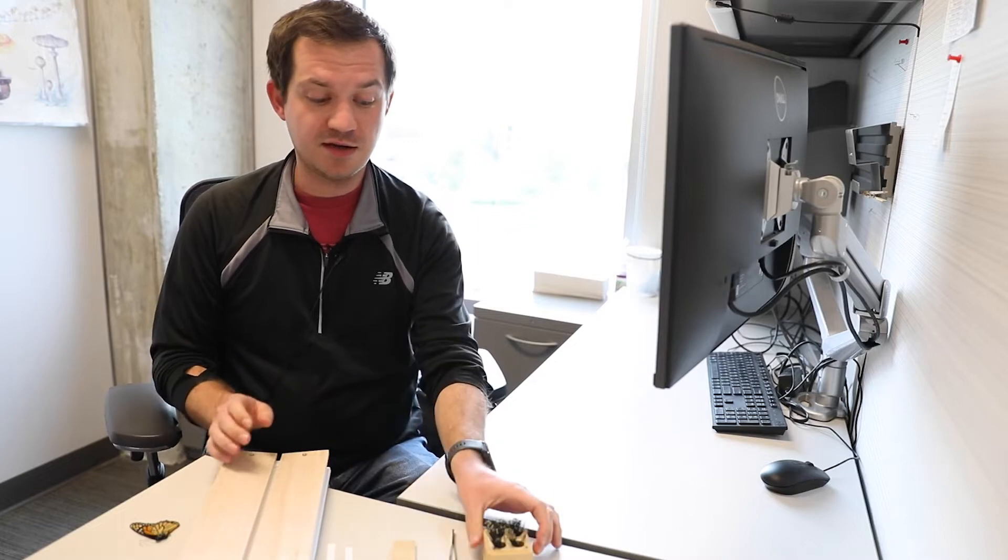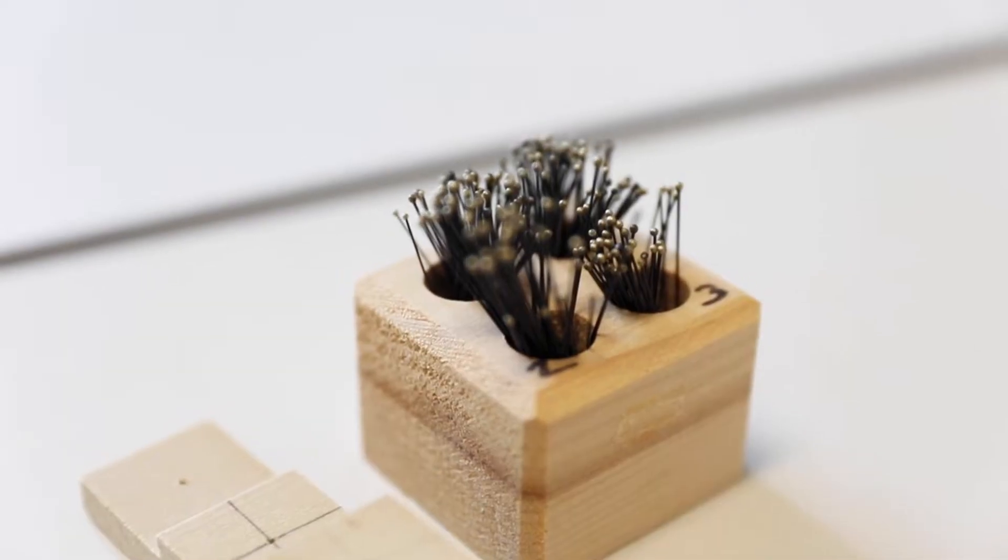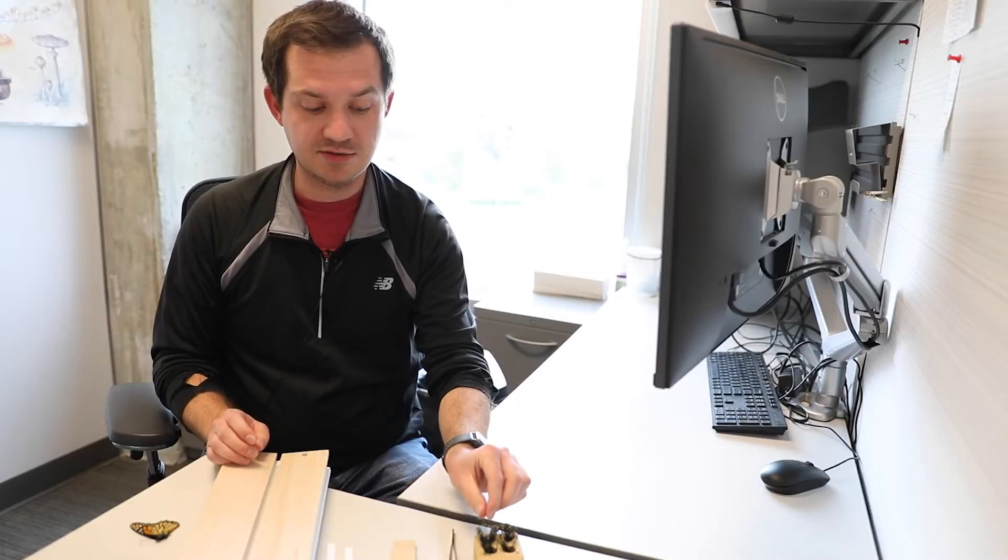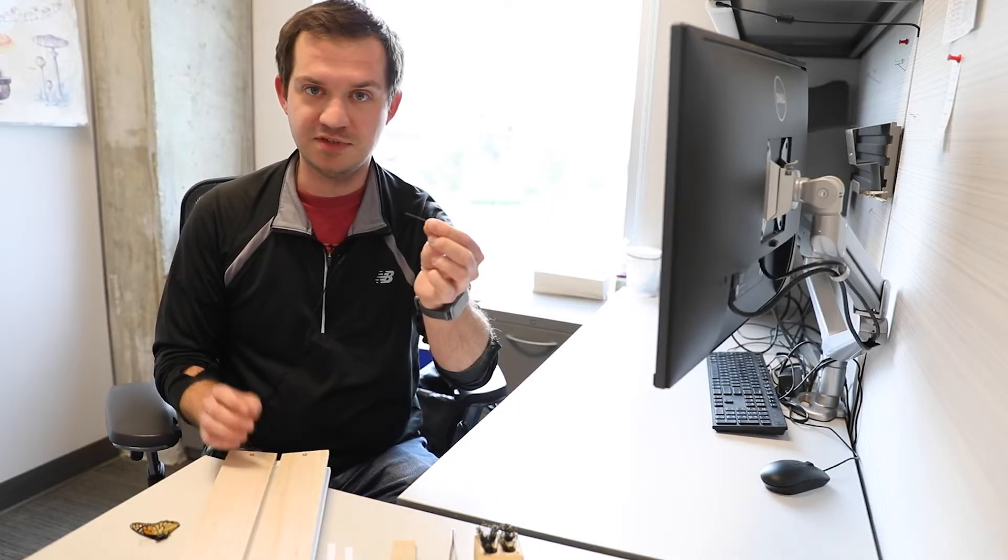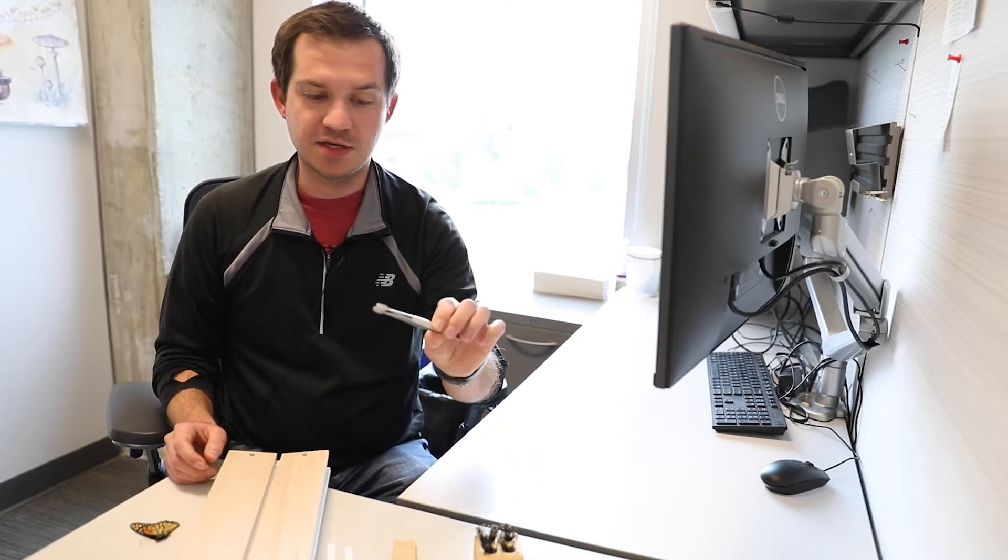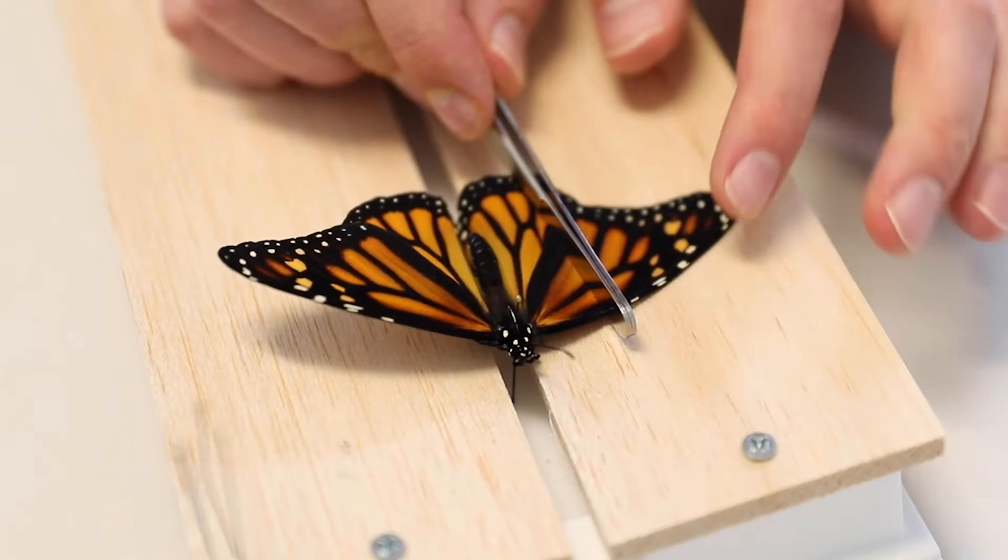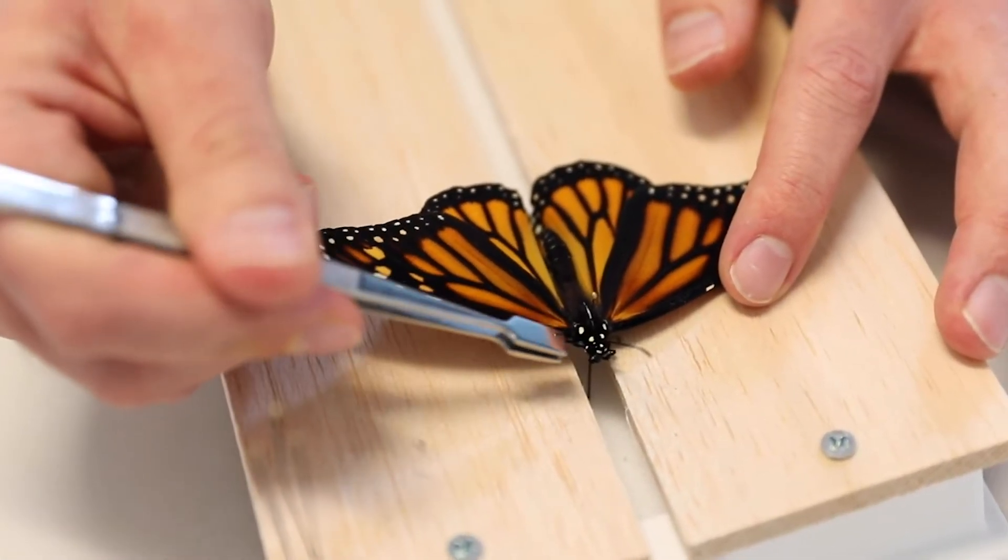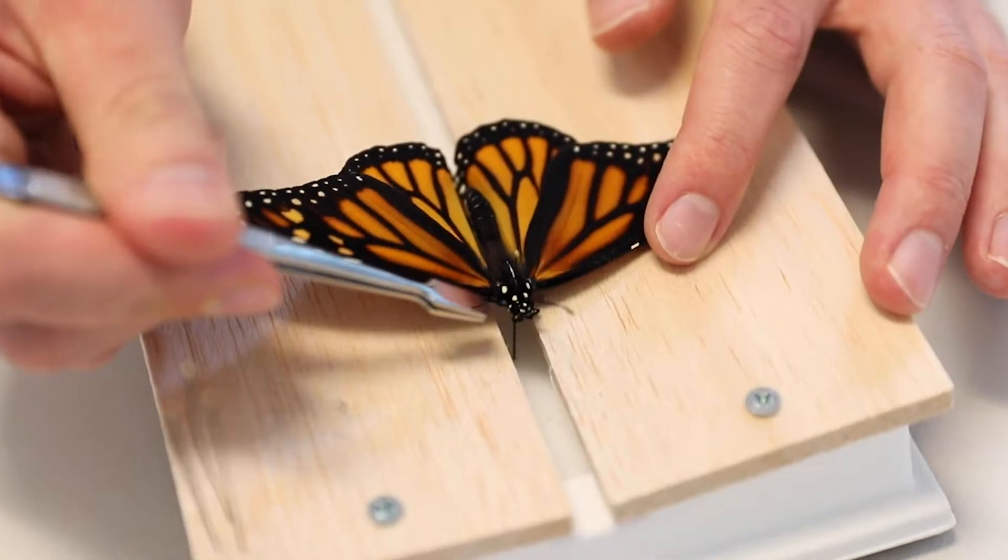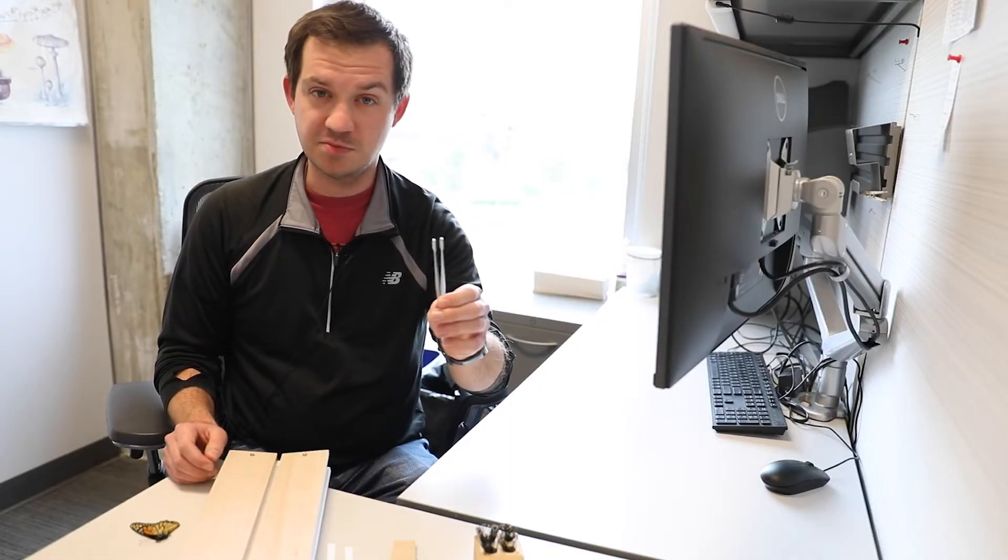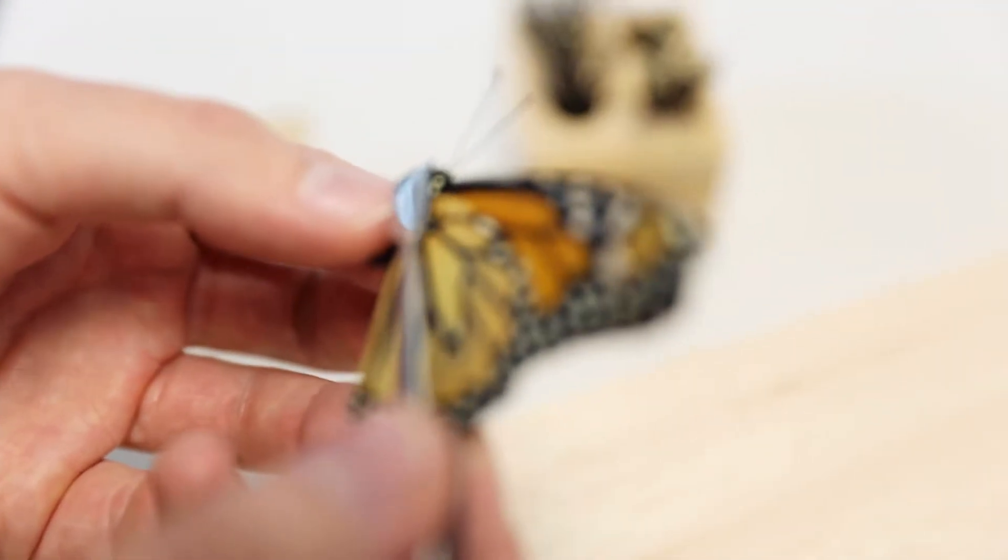Some other things that you're going to need: obviously some pins, standard size insect pins, usually the thickness of a thin sewing needle. We are going to use forceps - I really like to use these little spade forceps that have a shovel-like end on them. Other forceps can work decently well, but the more you get to that spatulate end, the better it helps to manipulate butterflies and moths when you're spreading them.